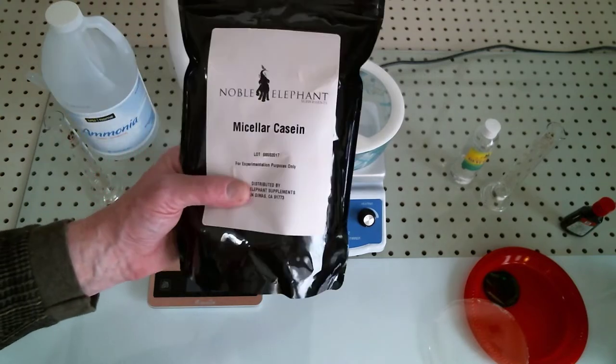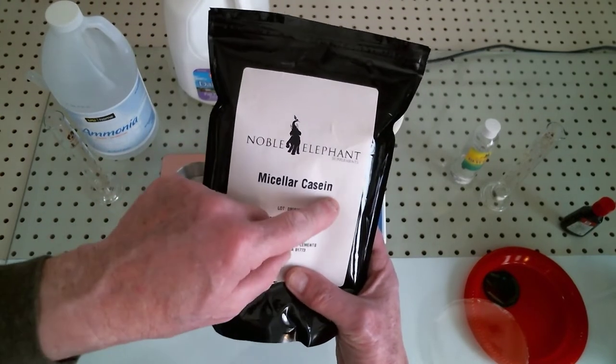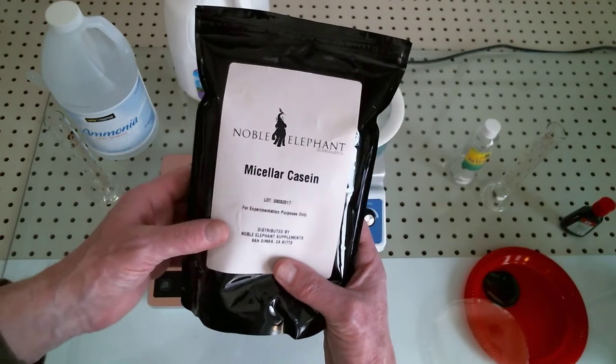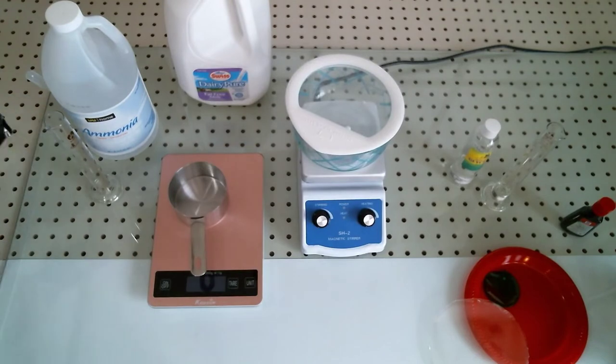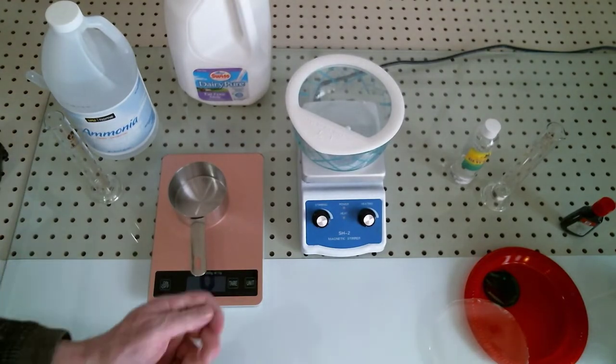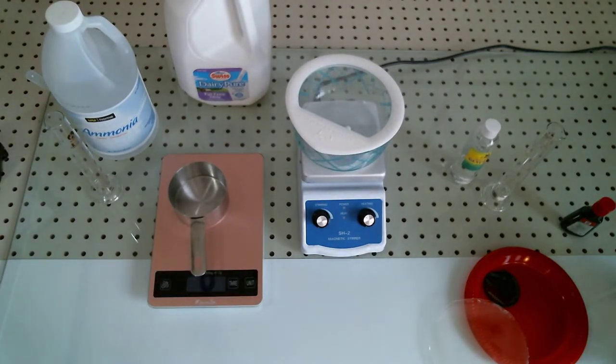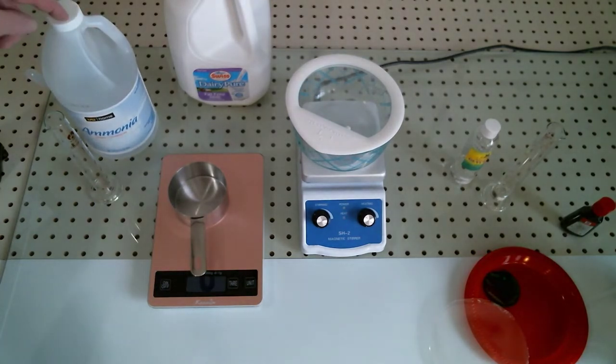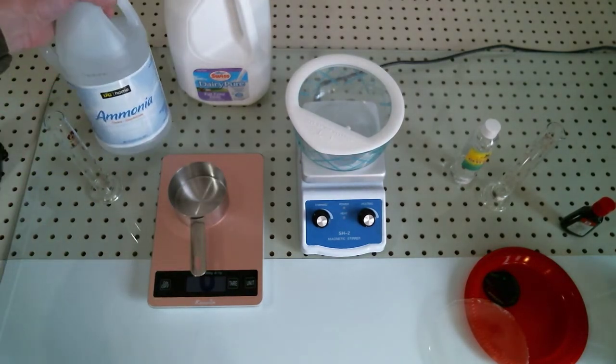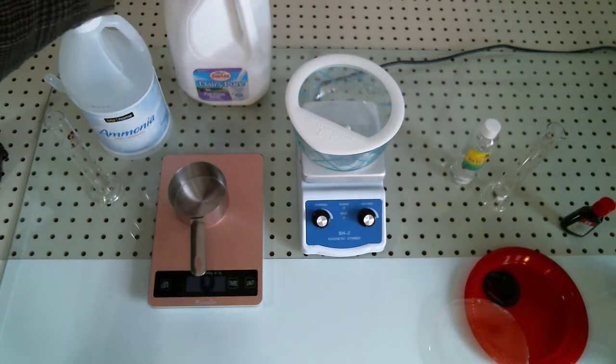What I like to do is to save a step and you can buy casein in a powdered form already. This is a bodybuilder supplement you can find online and it will save you some steps. We're also going to use ammonia, a strong alkali, and that's what's going to dissolve the casein into a clear film.